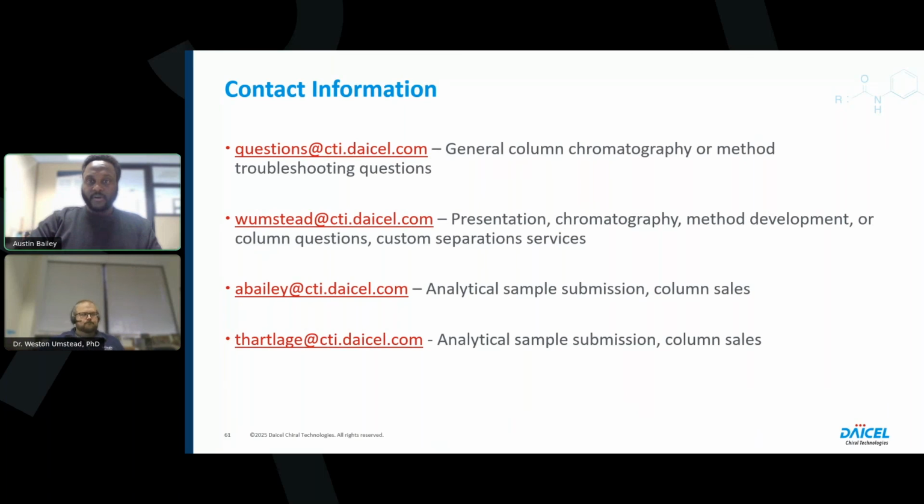All right. Thank you very much, Wes. All right. So next we do have a question from Paul. Paul is asking, since the ADH and the IA have the same chiral selector, will the separation be the equivalent under the same conditions?